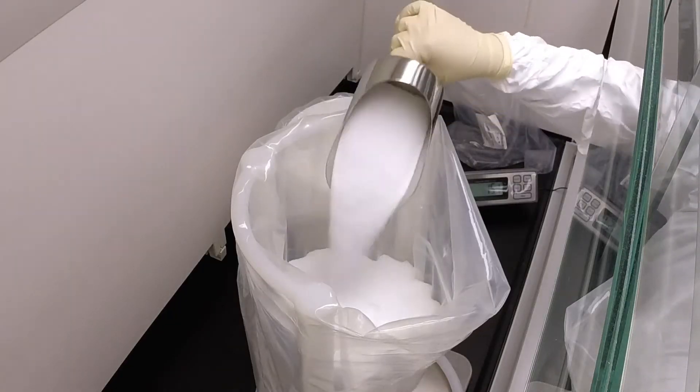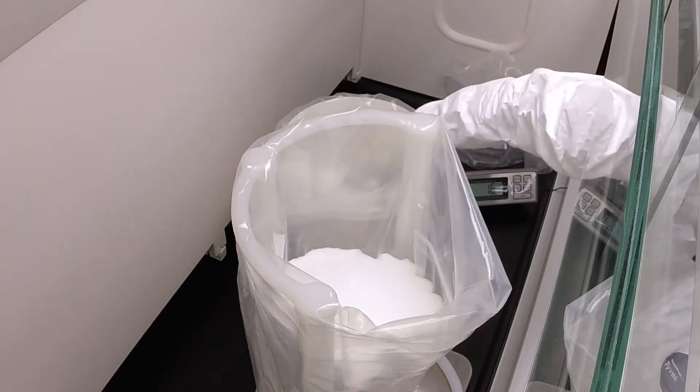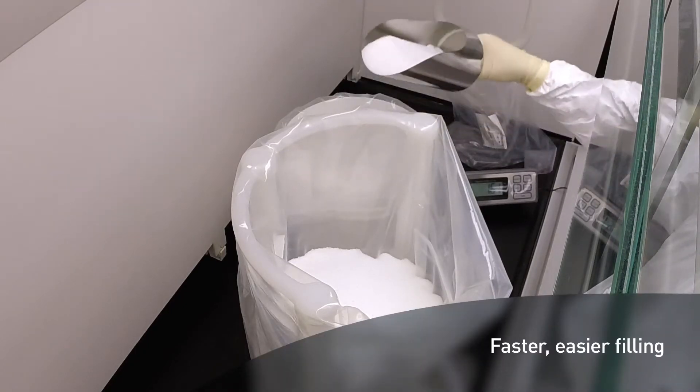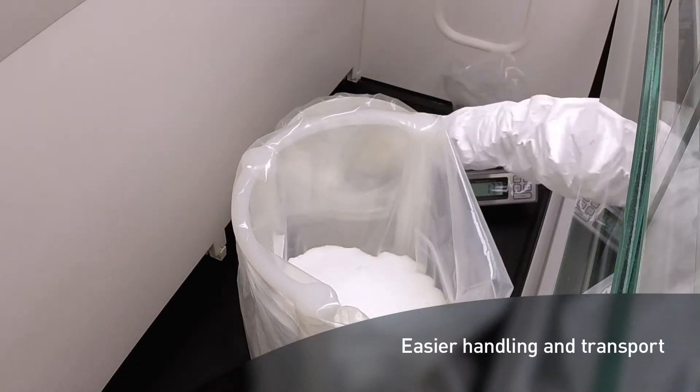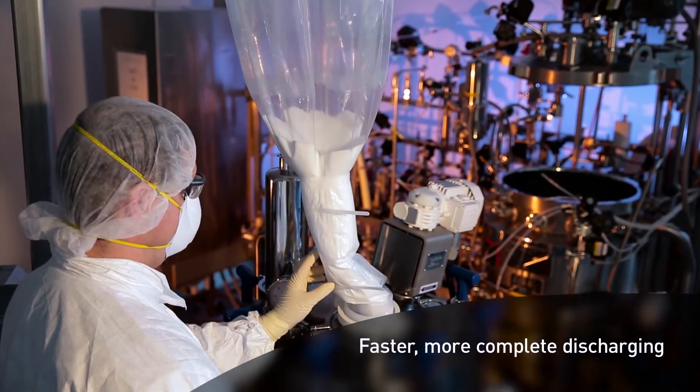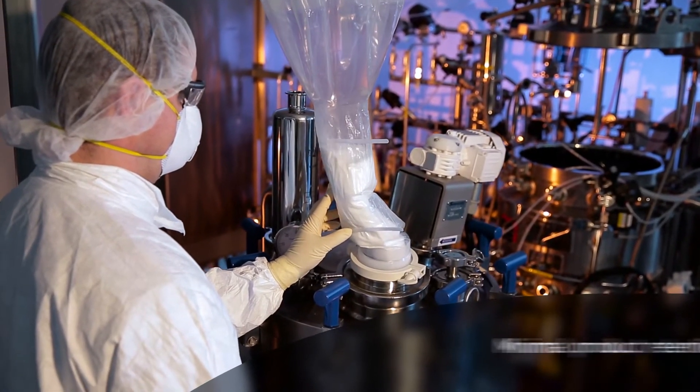Compared to competitive two-dimensional bags, our three-dimensional EZ-Biopac bags offer faster, easier filling, easier handling and transport, faster and more complete discharging, and minimal product retention.